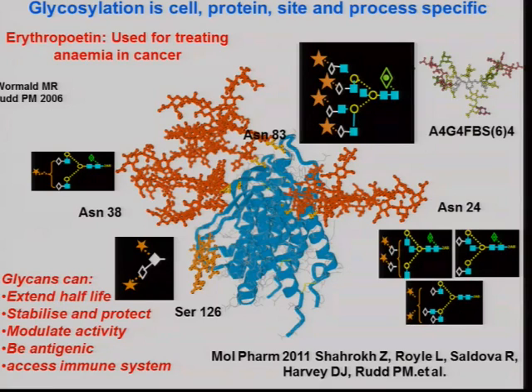You'll get good quantitation. And the other issue, see, when we do LC, we always talk about relative quantitation. So we take all the area and all the peaks, that's 100%. And then we say this glycan represents 58% of the glycans in the total profile.